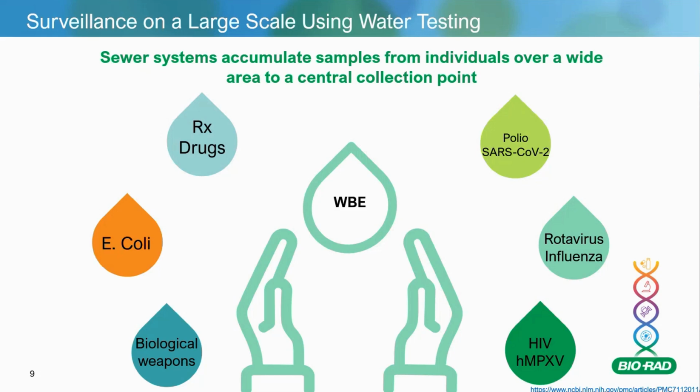Also, often you will see a big spike in wastewater well before you'll start to see an increase at pathology labs, just because of the delay in people going to get tested from once they start to show symptoms. And also you can use it for monitoring things like institutes, maybe universities, or some specific outbreak in specific areas, and knowing what to do to be able to monitor and to treat them.